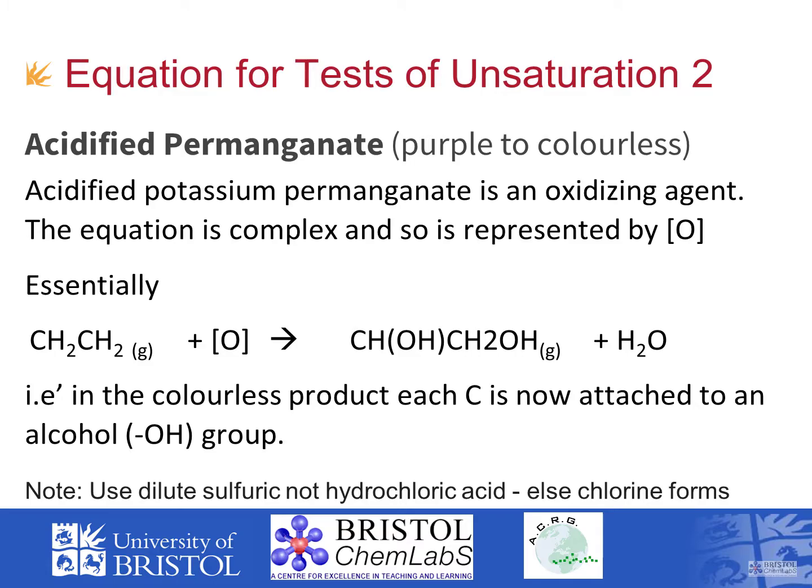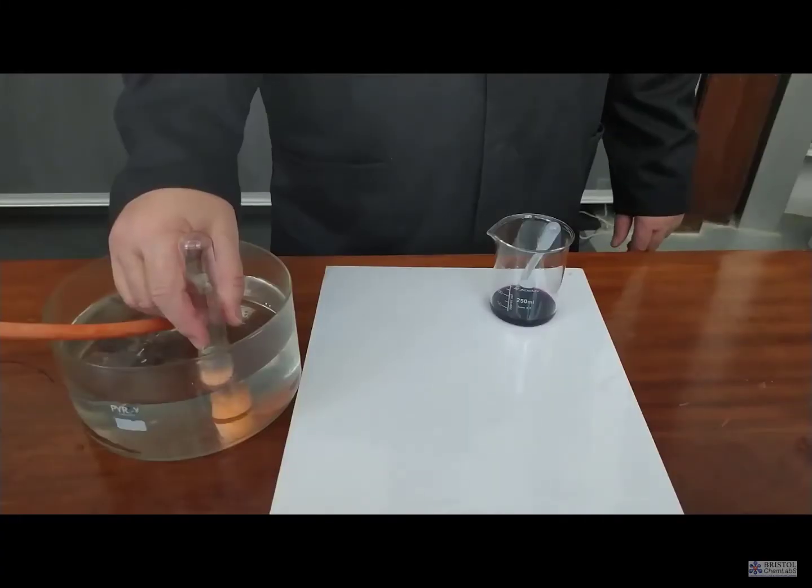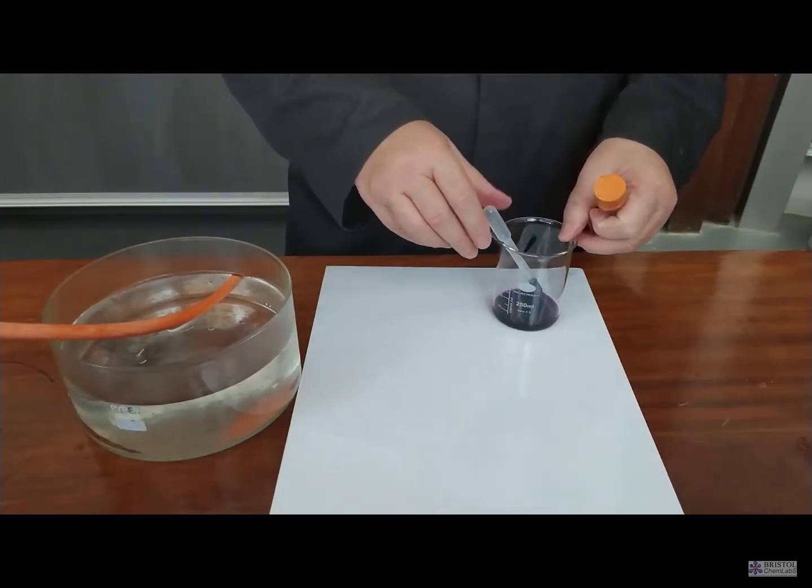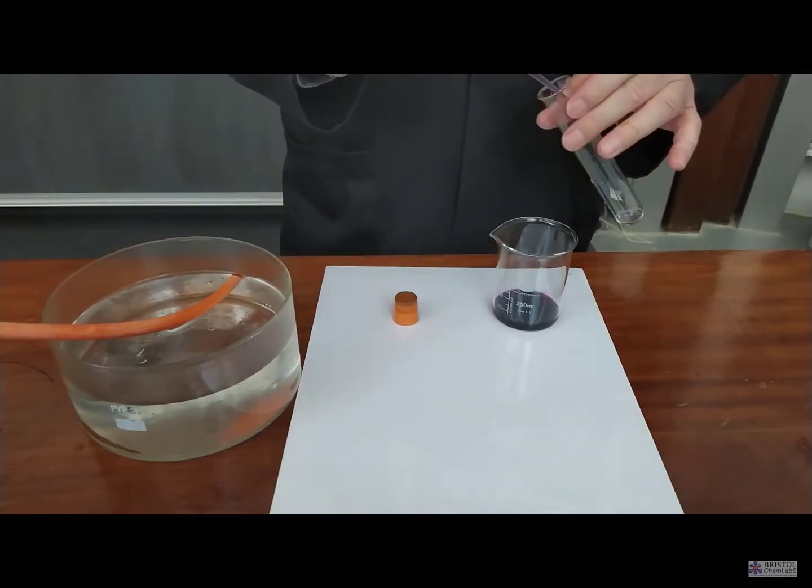With the test for potassium manganate 7, there are a couple of errors that you could do to not show the desired effect. You could make the potassium manganate 7 far too concentrated, and you can use too much. We've done both in this example.